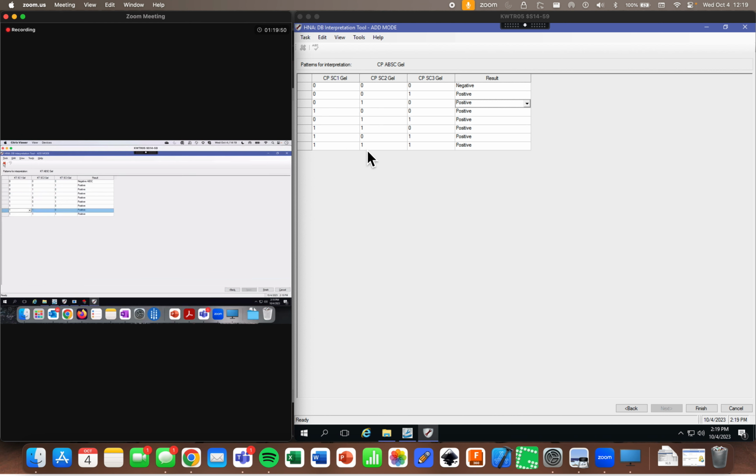I don't know. Maybe I just overcounted there. 1, 2, 3, 4, 5. It says there's 8. Yeah, it might. I mean, as long as the answer it's giving is the same, hypothetically, probably would just be fine. But yeah, it could potentially cause result entry to have a tiny bit of a conniption fit.